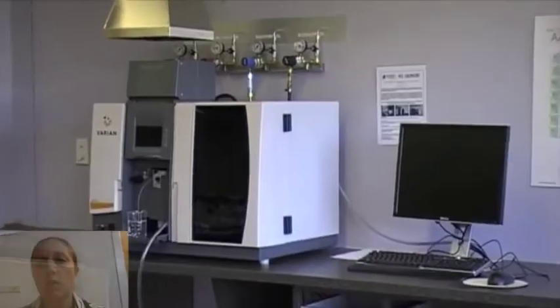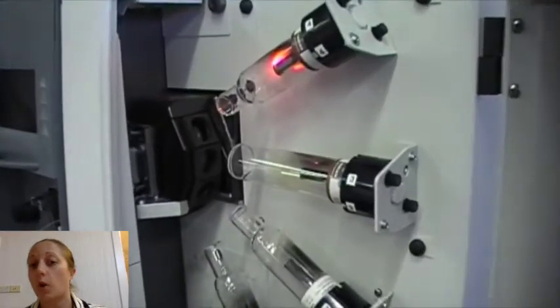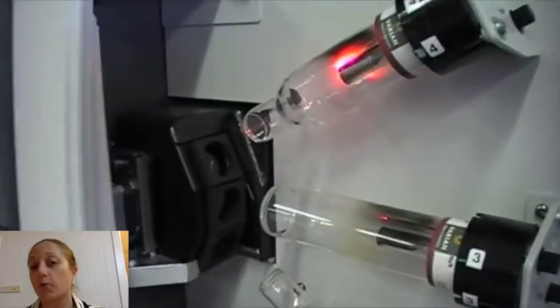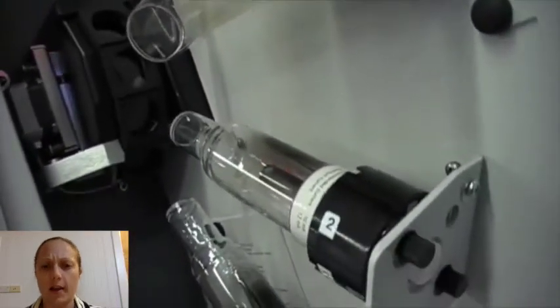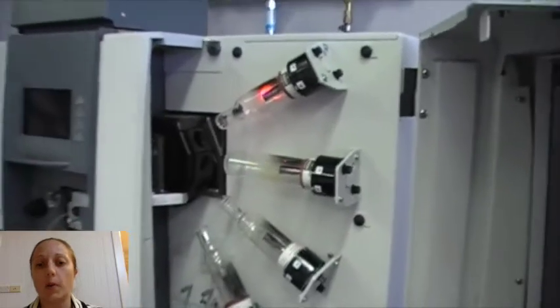The atomic absorption spectrometer has some important components. It has a hollow cathode lamp. That lamp sends out a specific wavelength to the metal we are investigating. We have a different lamp according to what we are investigating at the time. So if we're investigating sodium, we'd have a sodium lamp. If we're investigating lead, we'd have a lead lamp. If we're investigating cadmium, we'd have a cadmium lamp. So it will send in the signal of the wavelength we are interested in.